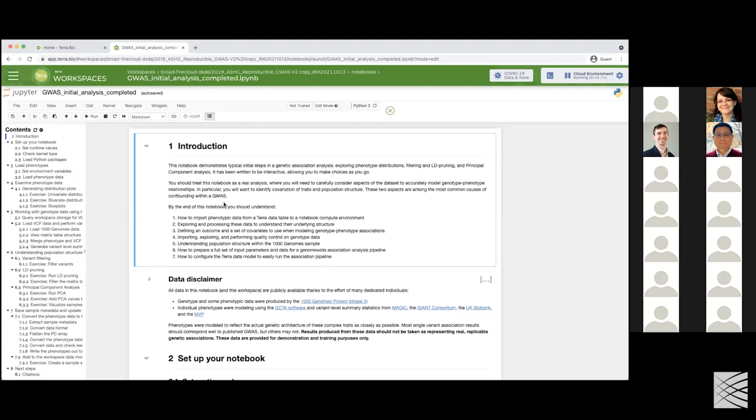Just the briefest of overviews of Jupyter Notebook features. On the left is a table of contents for the notebook. And actually, when you run code cells, a lot of our notebooks in the TOC, it will color code what's still running and what's done. There's a menu bar at the top, and then some shortcut icons below. You can see which language kernel is currently being run. It says Python 3. You could switch that to R on the fly if you'd like, but it has to restart the kernel.